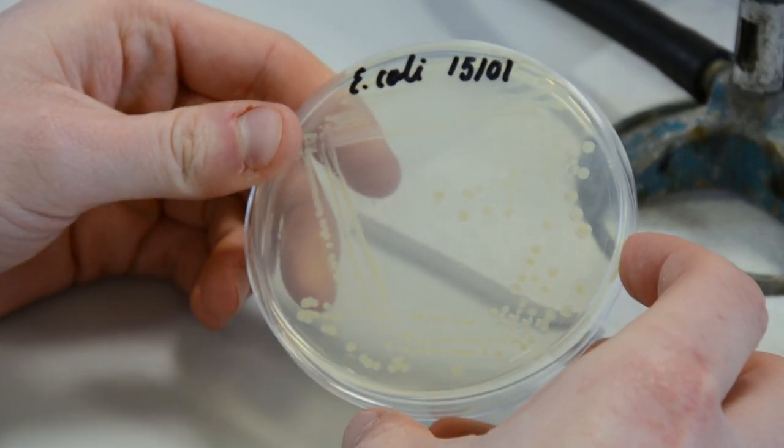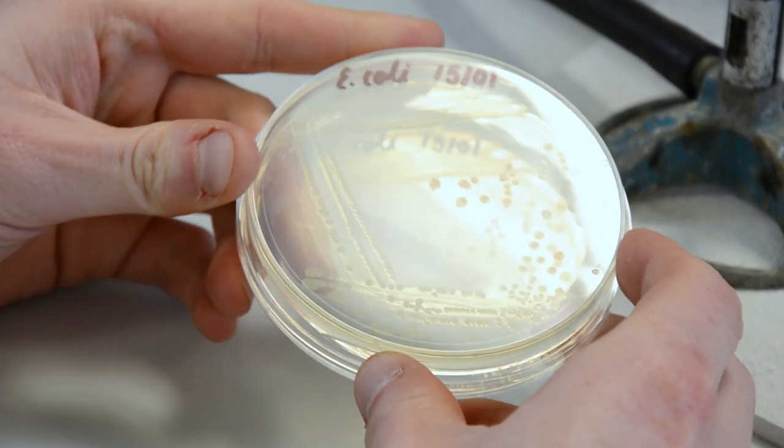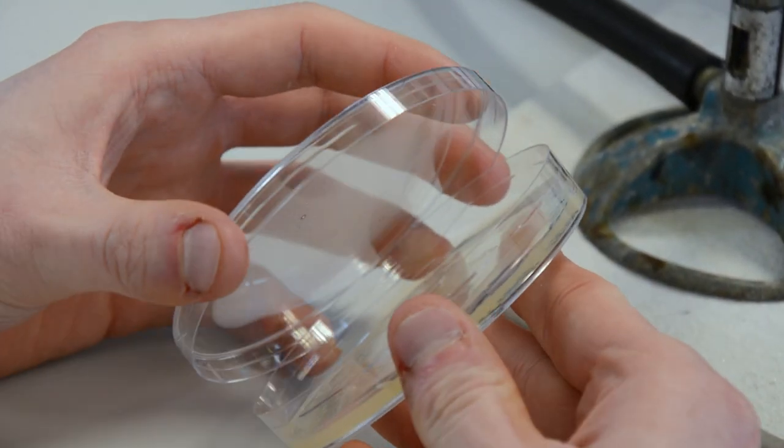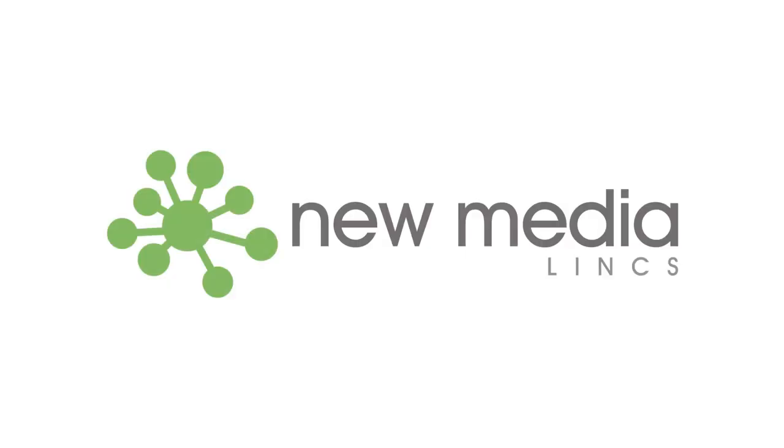In a pure culture, all colonies will look alike in shape, color and texture. If any colonies have a different appearance, that probably suggests there are contaminating organisms present.